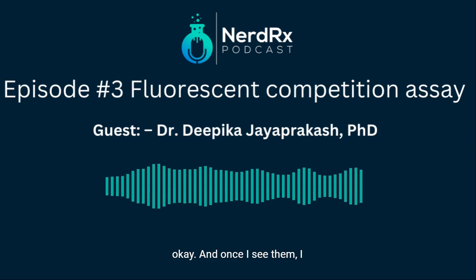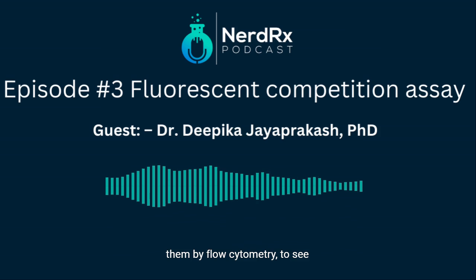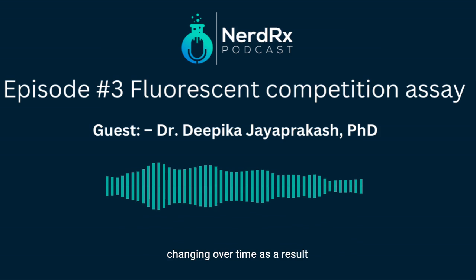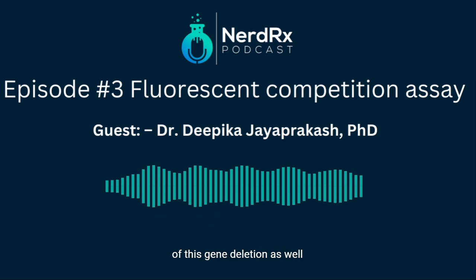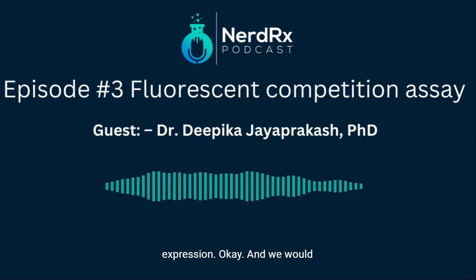Once I seed them, I culture them for a few days, and whenever I reseed them, say every 3 or 4 days, I reanalyze them by flow cytometry to see the difference in the ratio of the cells I'm culturing. That ultimately gives me the percentage of colored and non-colored cells, which change over time as a result of this gene deletion, as well as my gene of interest's expression.